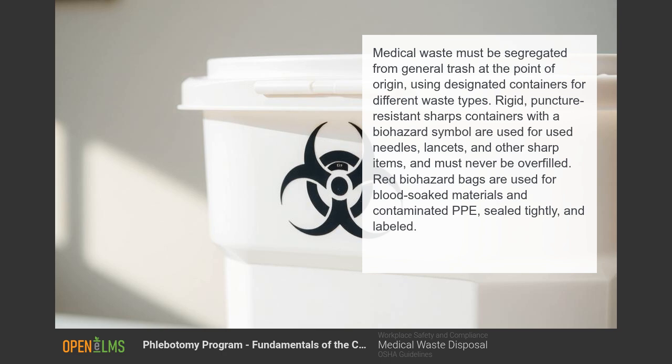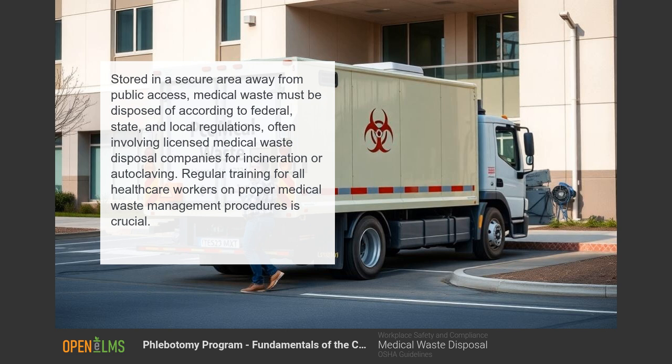Rigid, puncture-resistant sharps containers with a biohazard symbol are used for used needles, lancets, and other sharp items, and must never be overfilled. Red biohazard... stored in a secure area, away from public access. Medical waste must be disposed of according to federal, state, and local regulations, often involving licensed medical waste disposal companies for incineration or autoclaving.